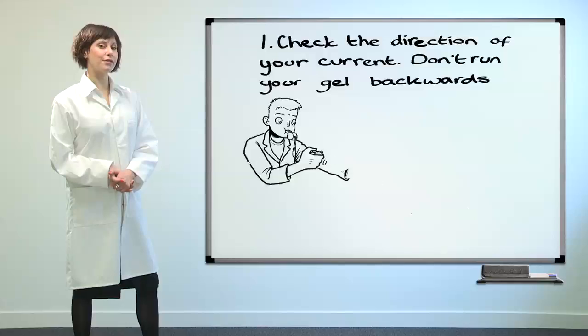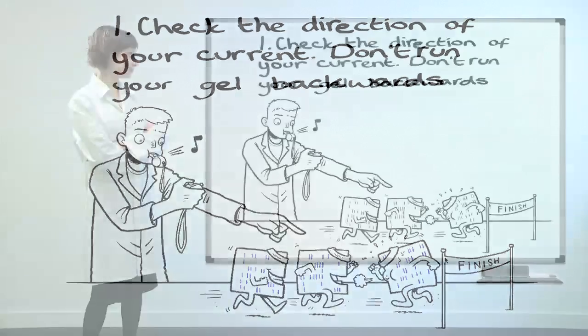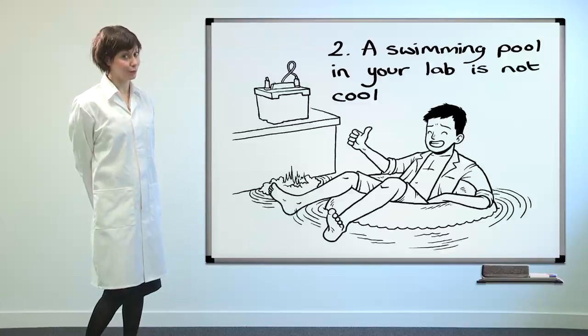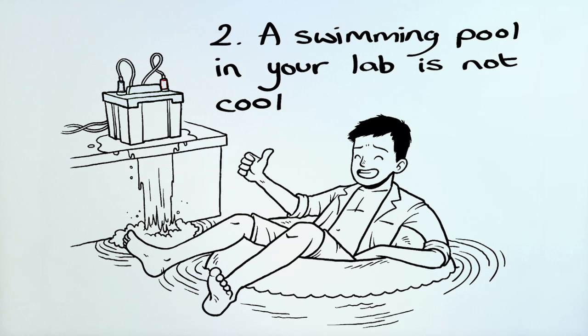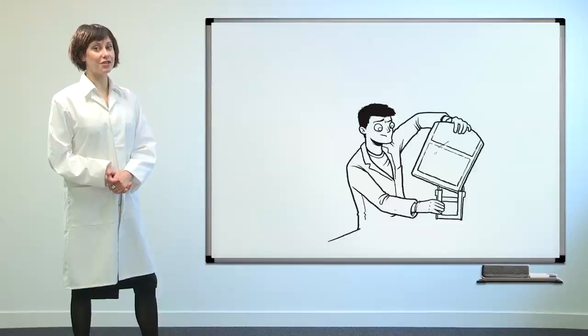Check the direction of your current — don't run your gel backwards. A swimming pool in your lab is not cool. Make sure you have the right size gel to start with.